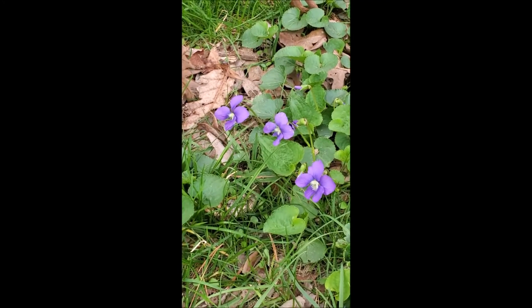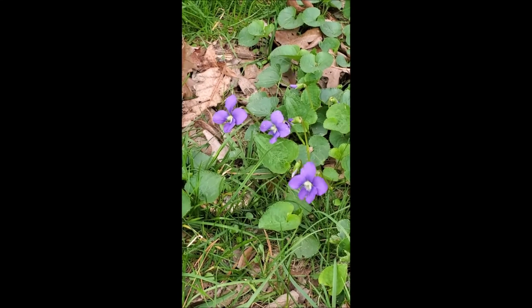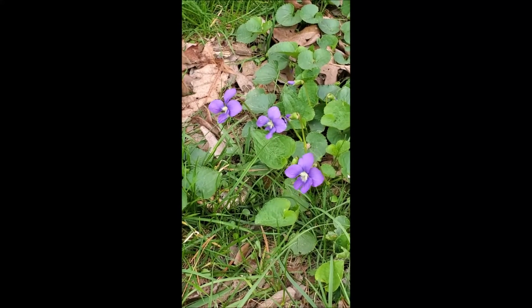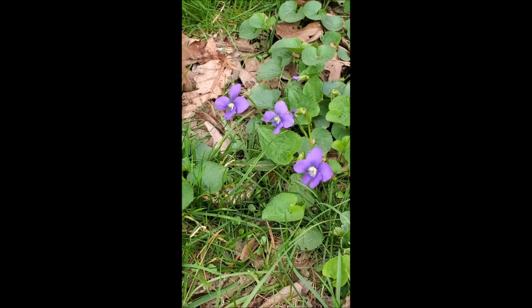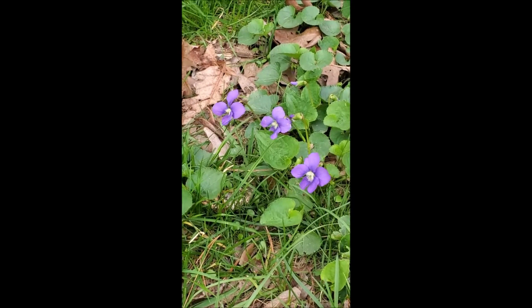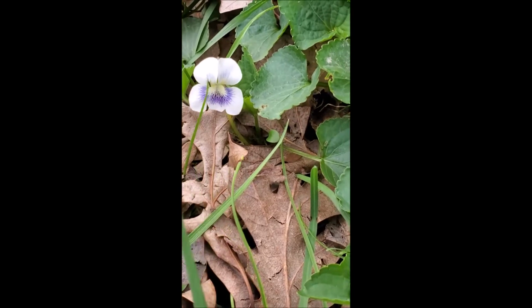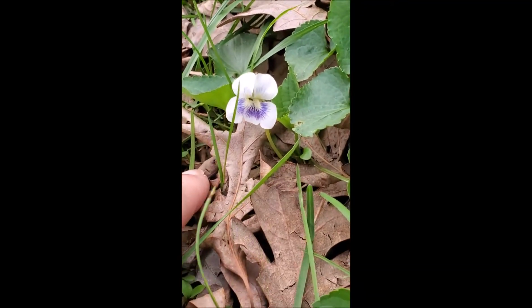These are common violets, and you probably have them in your lawn too, which makes them an excellent subject for today's lab, even though they're not a super simple generic type of flower, but that makes it more fun. Typically they are purple, that's why they call them violets, but if I just zip on over here, we'll see that there is in fact a white one, or at least a white and purple one, and that's one of the kind of neat things.